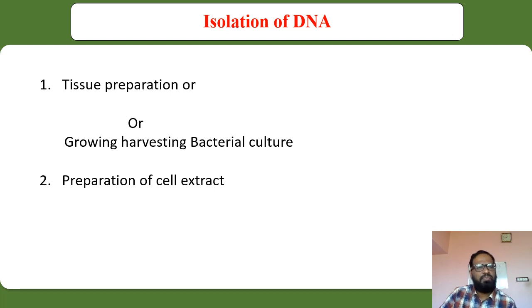Next step is the preparation of the cell extract. Now you have to lyse open the cell, so that whatever the content of that particular cell is, it should be released into the media, and that particular process is called the preparation of the cell extract. This is also a very important step.